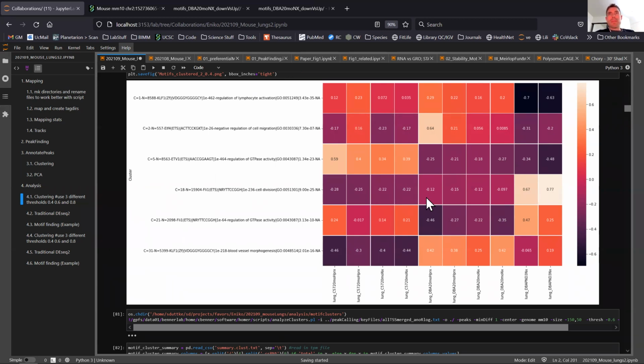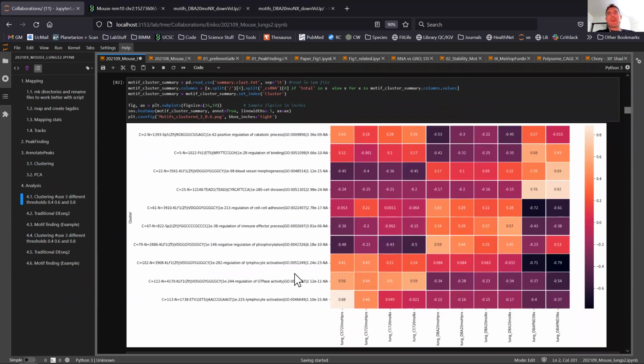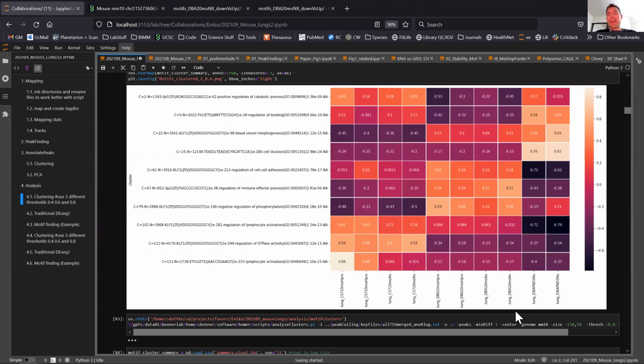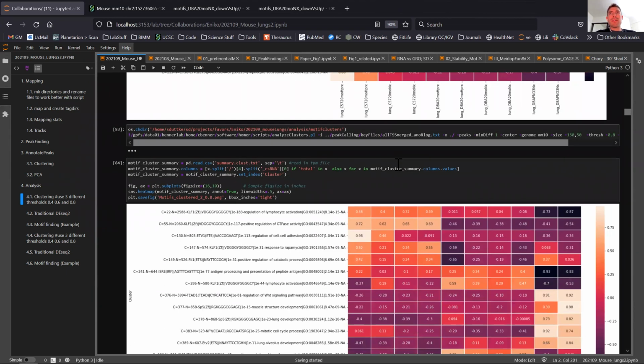But again, this might also be a little bit complicated because it basically throws all genomic hammers at your data at the same time. When you do something like that, you want to have different thresholds to see, do we recover the same motifs? Do we recover the same trends? And you see here, this is the KLF, which is basically a GC box that is still pretty much here and also in these clusters, which tells me these ones have really long SP clusters or GC box clusters.